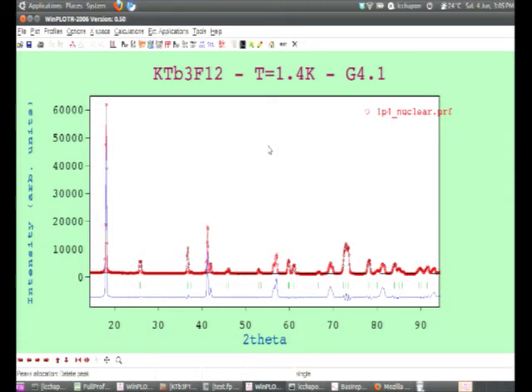Another thing is this amplitude, which is perfect. Well, magnetic scattering, of course, FullProf is kind of leading and the best and the first to do these things, but it's very complicated because it's a proper symmetry analysis that is done. One has to have a lot of understanding actually to do it. Well, magnetism you can do in a lot of software.